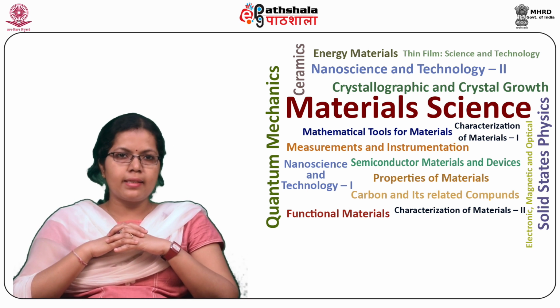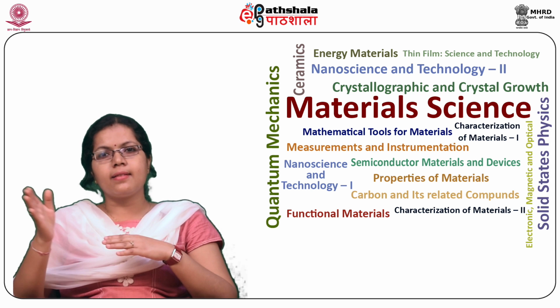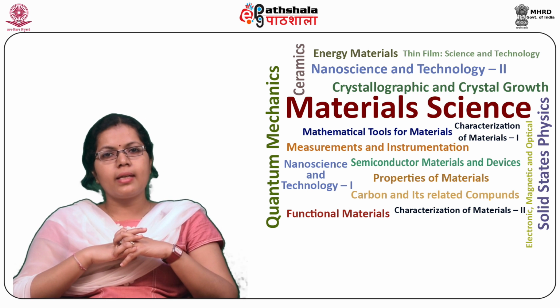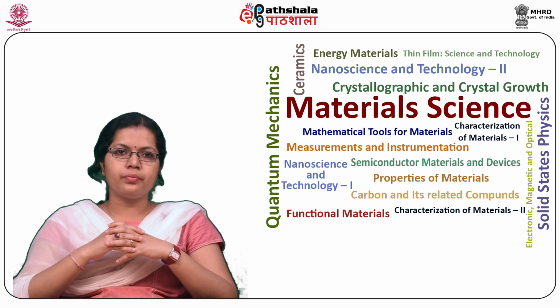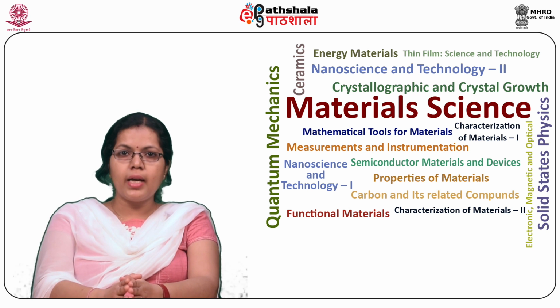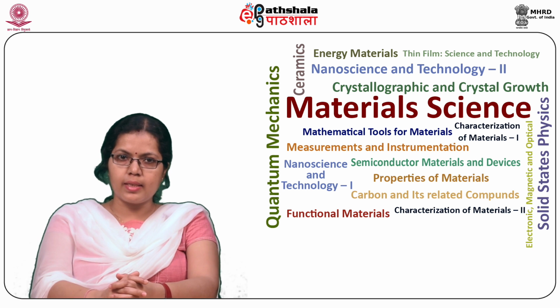Fourth component is the detector. The detector detects the intensity of light transmitted by the cuvettes and sends this data to a meter or recorder to display the values. Electronic detectors calculate and compare the intensities of light beams. Several UV-vis spectrophotometers have two detectors, a phototube and a photomultiplier tube, and reference and sample beams are monitored simultaneously.